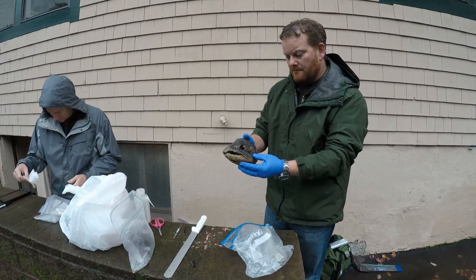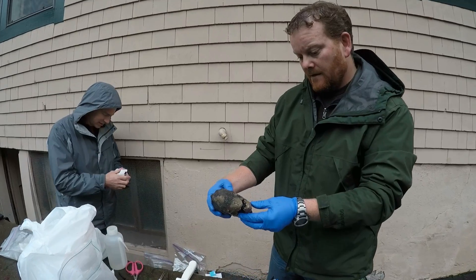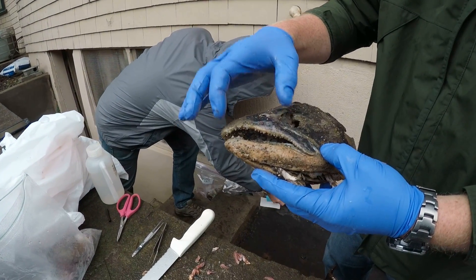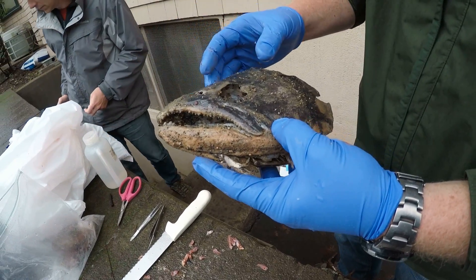Here's a Chinook salmon head. This looks like a female — just looking at the shape of the snout, it's really short. A male's snout would be hooked and longer.